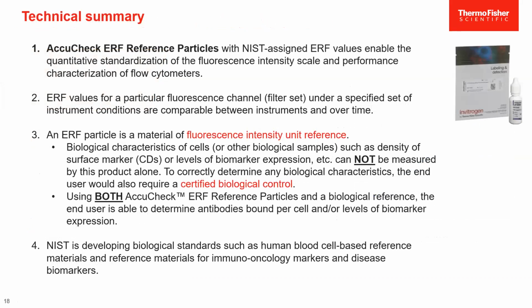But now we go to a technical summary. I mainly want to say these ERF beads with assigned ERF values will enable the so-called quantitative standardization of a fluorescent intensity scale of the performance of flow cytometers. ERF values also help you to assign your samples' values, but you have to make sure you use the value in the table for the particular fluorescent channel, or say filter site.